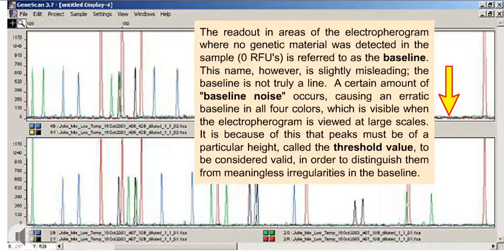A certain amount of baseline noise occurs, causing an erratic baseline in all four colors, which is visible when the electropherogram is viewed at large scales. It is because of this that peaks must be of a particular height, called the threshold value, to be considered valid in order to distinguish them from meaningless irregularities in the baseline.